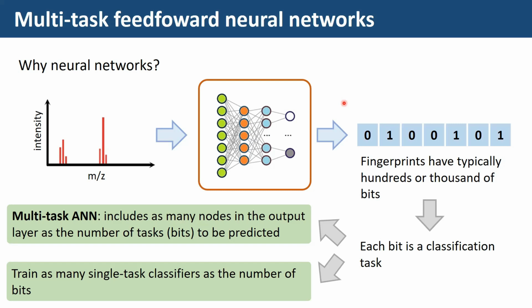And then it's more or less easy to compare the fingerprints which have been predicted to online databases, and it's easy to calculate. So it's fast to calculate fingerprints. So this is why, in all these studies, the standard is to use fingerprints.